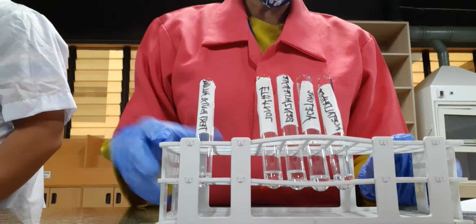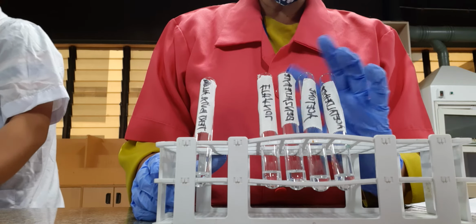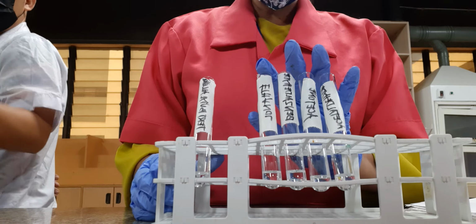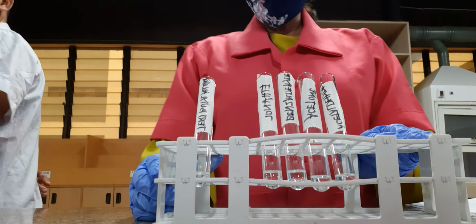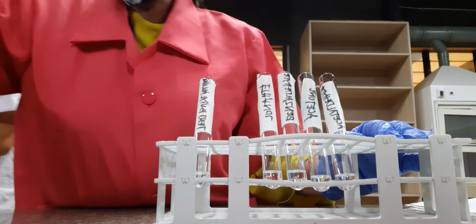Okay. So once again, we have 1 ml of acetaldehyde, 1 ml of acetone, 1 ml of benzaldehyde, 1 ml of ethanol and 1 ml of tert butyl alcohol. And then we will subject this one to Tollens test.